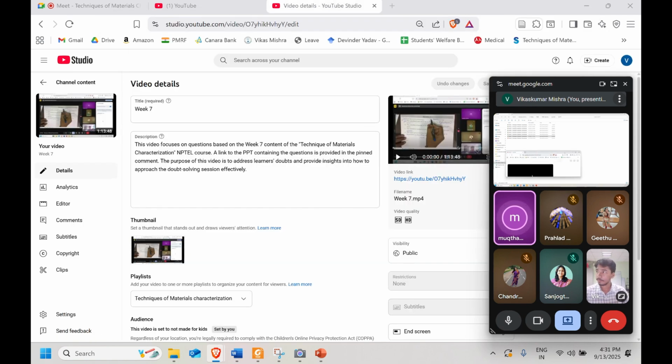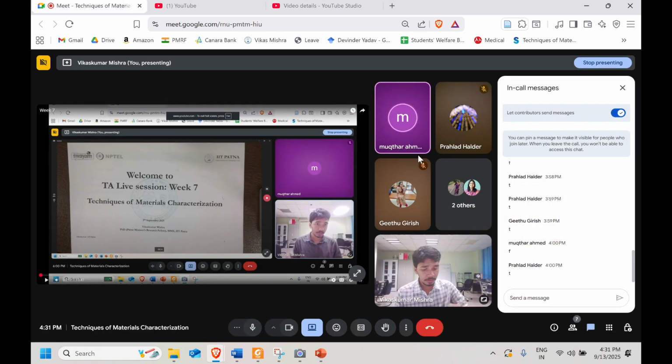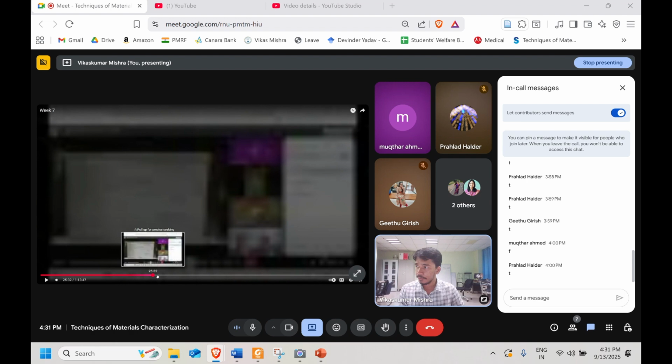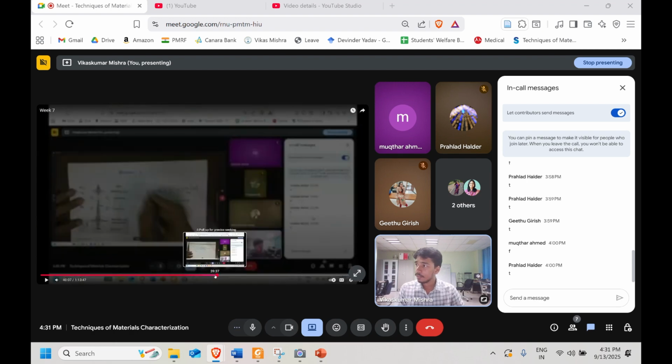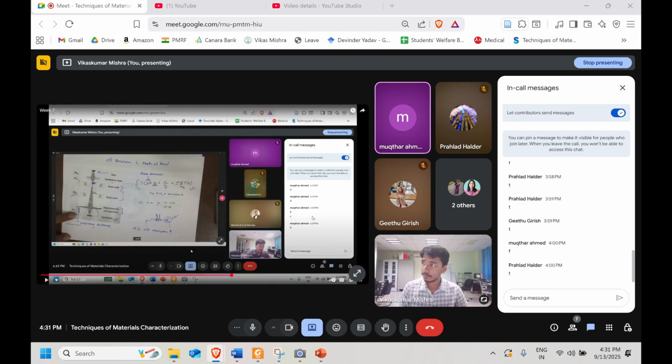First, listing out the factors influencing this, I'd like to understand clearly. I see you want to know how things like the magnification and the current are related with each other, right? That part we have to think. And maybe working distance is also influencing the magnification and the resolution as well. Yeah. So here we can see, in this class we talked about the probe diameter, and also that if we keep on decreasing the probe diameter, we keep on increasing the resolution. Now entirely this magnification, the effective magnification which we are talking about.